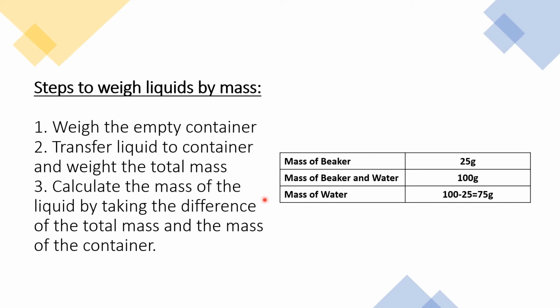If you know that you're going to be able to take advantage of that tare function, then by all means do so. But in most cases, especially when we're doing labs here at school, those balances are active balances and are getting used by everybody. So doing a full write-up like this, where we take the mass of the container and the substance, and then calculating the mass of the substance at the end, can be really important, and make sure that you don't get halfway through a practical and have completely botched all of your masses for the rest of the experiment. But anyway, let's go have a look at this reaction.